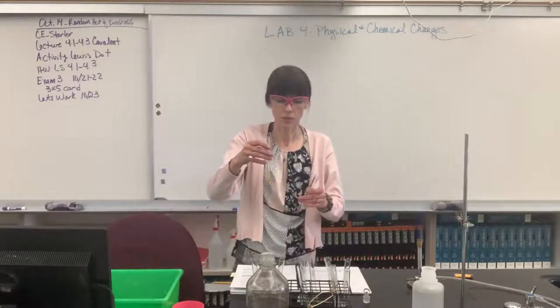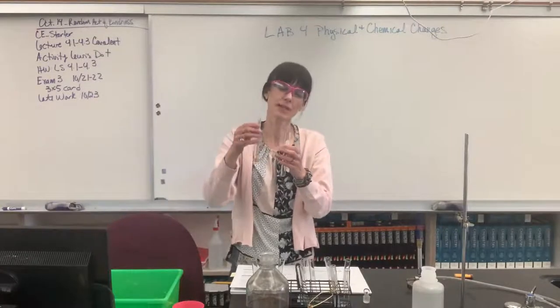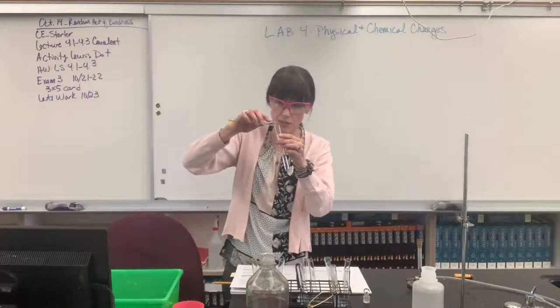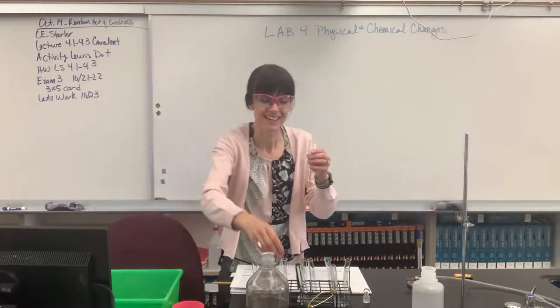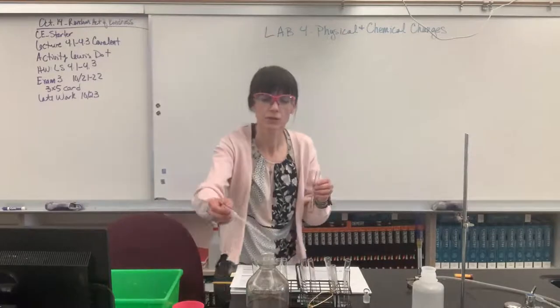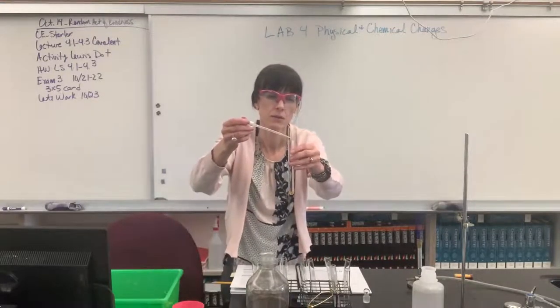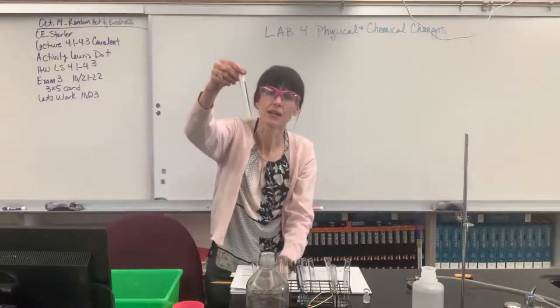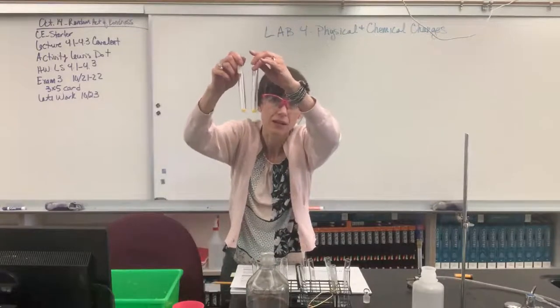So I'm going to pour just a little bit of this. Remember, we had to pour 10 drops into 2 other test tubes. I'm going to pour 10 drops into this test tube. Nice. And so I'm going to add our, let's see, how many drops of silver nitrate? 2 drops of silver nitrate. 1, 2. And sure enough, it's a cloudy yellow. It matches this one. They're both that cloudy yellow color.